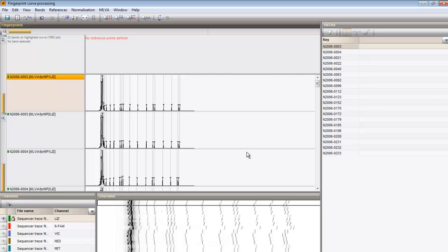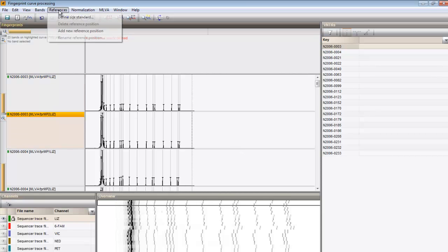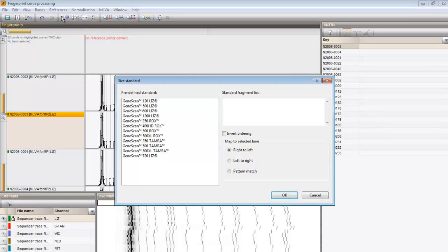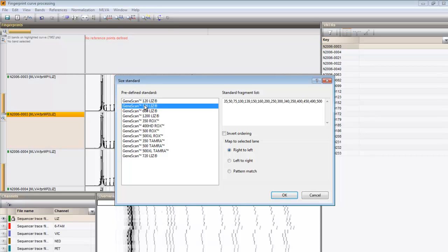To have a reference system automatically created based on a lane containing a commercial size marker, first highlight a suitable lane and select References Define Size Standard. I select the Genescan 500 lids, select Pattern match and press OK.